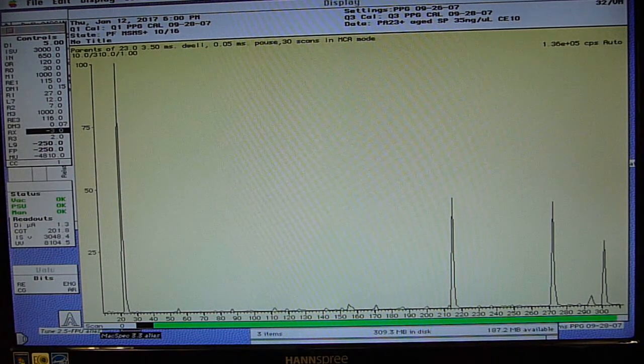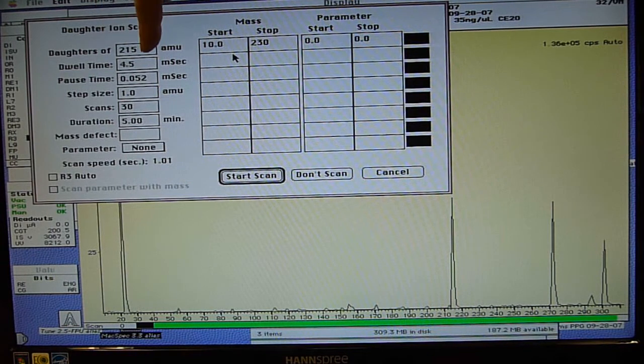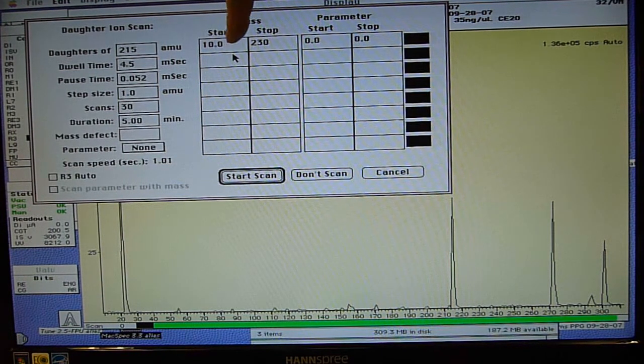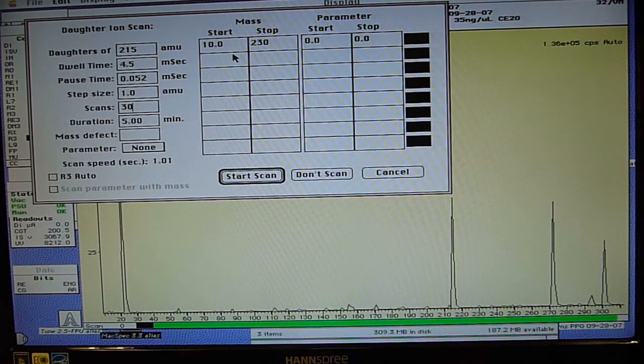Let's save this data. And just to confirm that 215 does generate, is a sodium adduct, let's set up a traditional product ion scan or in old terminology daughter ion scan. So Q1 is going to let in 215. And Q3 is going to scan from 10 to 230. 1 AMU steps, 30 scans. We're going to add it up. And we're going to start the scan.